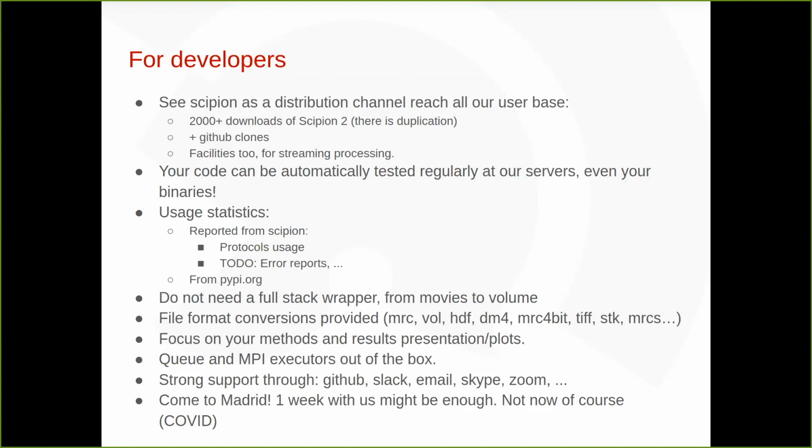There are a bunch of file formats: MRC, HDF, DM4, you name it. It's a bit of a nightmare, and we are dealing with these file format conversions. So if you have a software, you don't need to provide all these conversions. You can just implement one, and then the plugin converts your file format, whatever is coming, to the one that you actually implement. So you can focus on your method and also on presenting the results, plots, whatever you want to provide the users with.